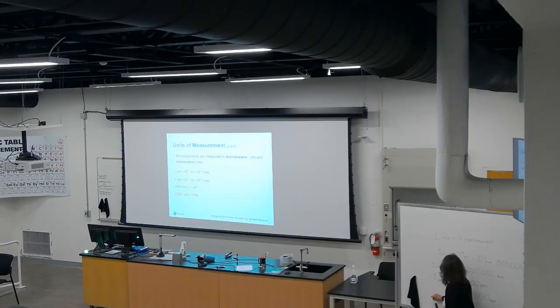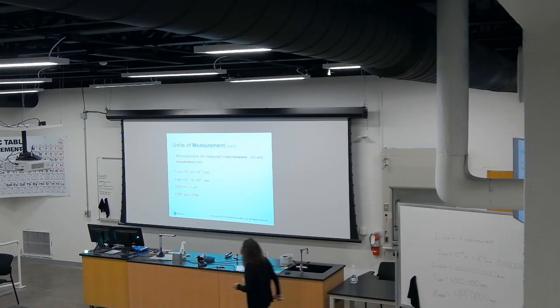So 10 millimeters equals 10 million. Another way is just to multiply this times 10. Because let's say that you have, instead of 10, 15. You can multiply 15 times this, and then you will get your 15 million. Okay.